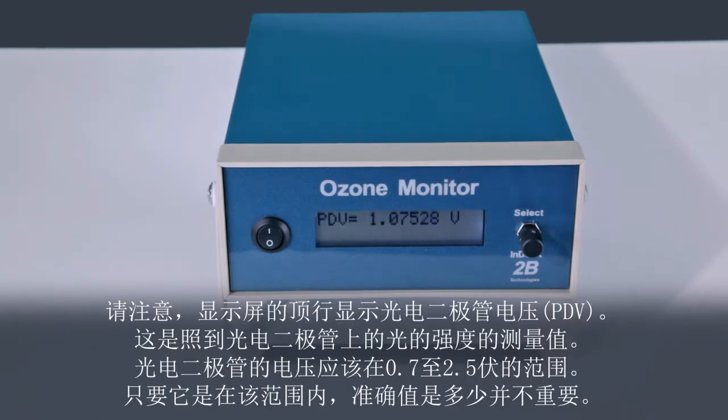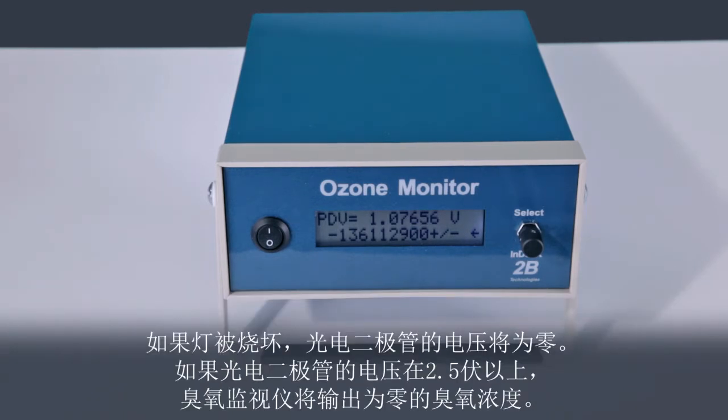Notice that the top line of the display provides the PDV, or photodiode voltage. This is a measure of the light intensity striking the photodiode. The photodiode voltage should be in the range 0.7 to 2.5 volts. The exact value is unimportant as long as it is in this range. If the lamp is burned out, the photodiode voltage will be zero. If the photodiode voltage is above 2.5 volts, the ozone monitor will output zero for the ozone concentration.